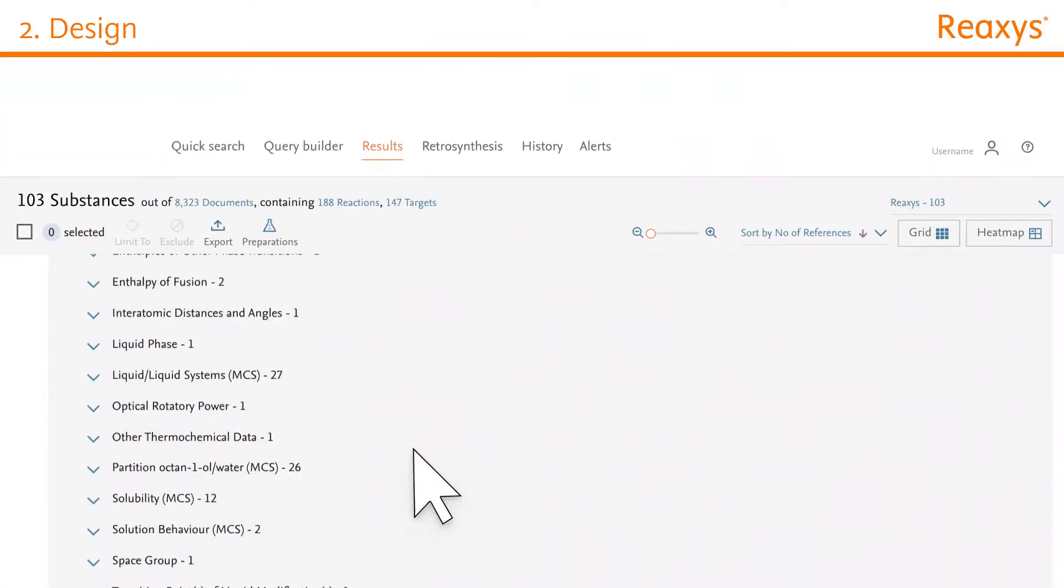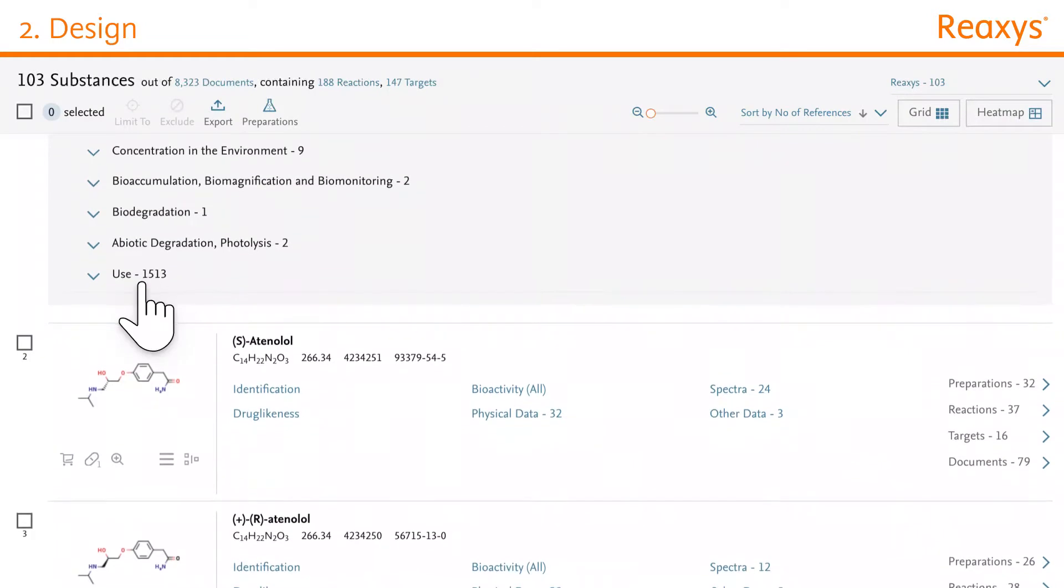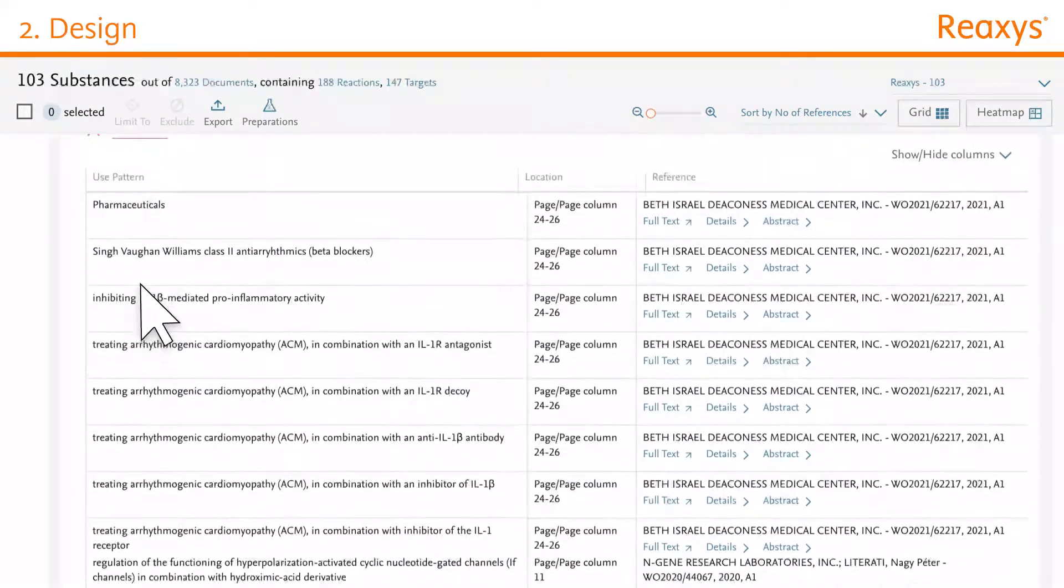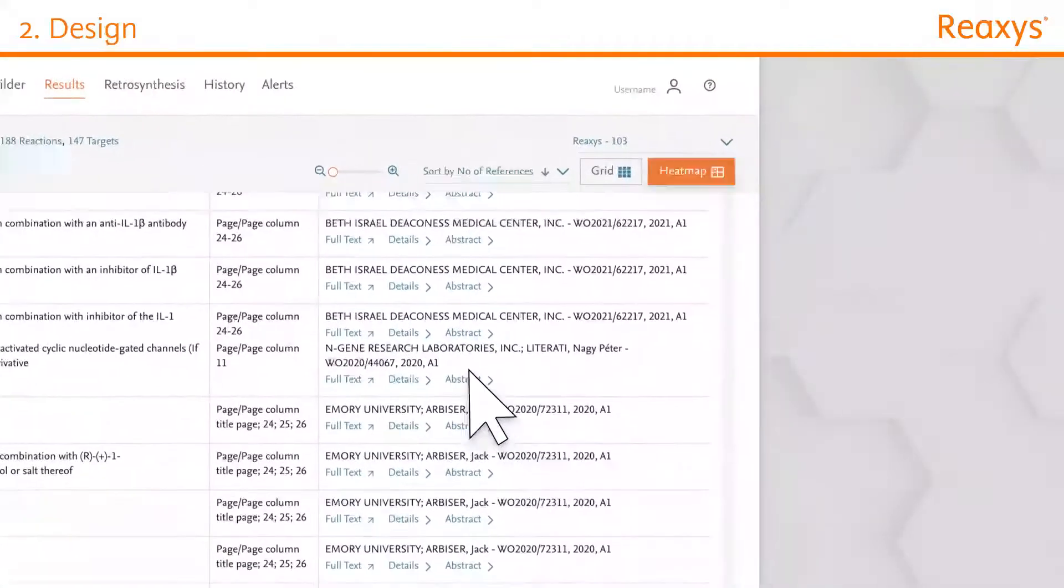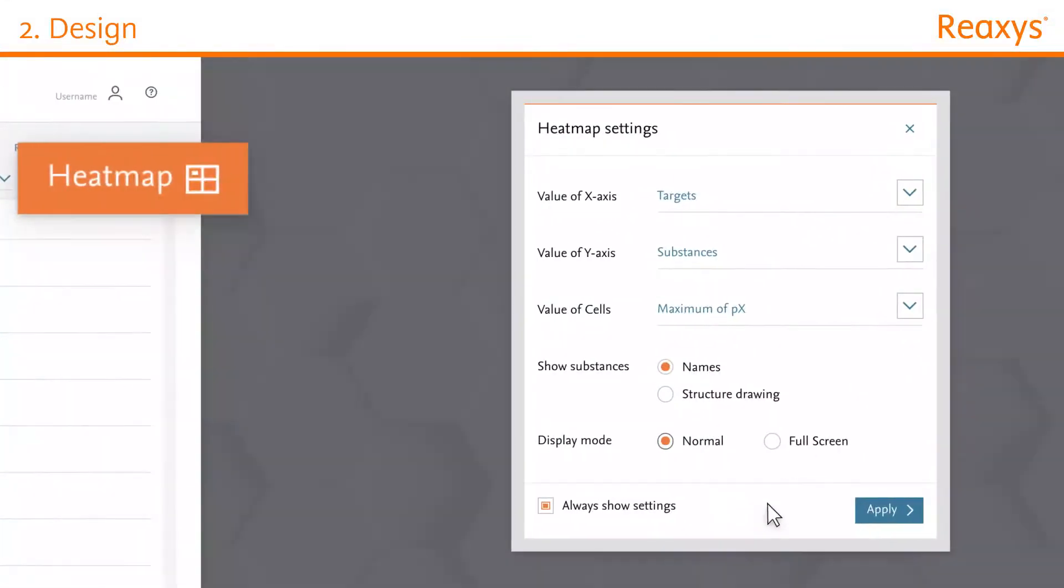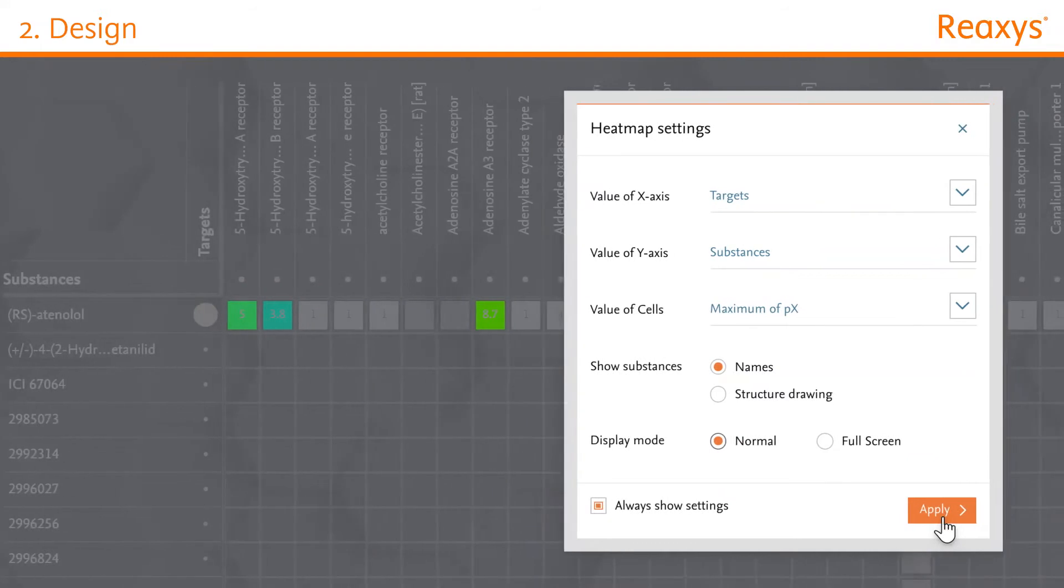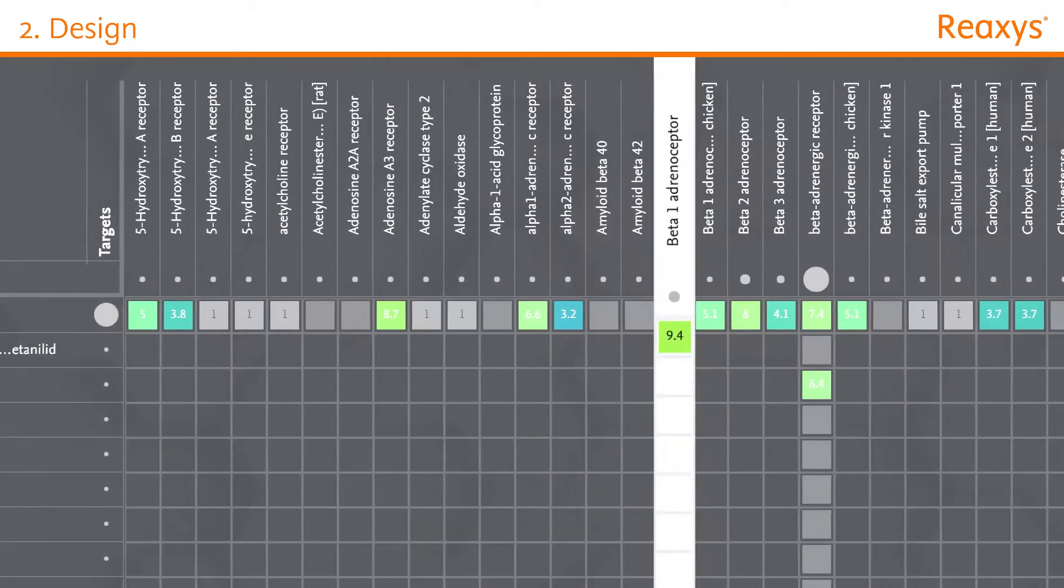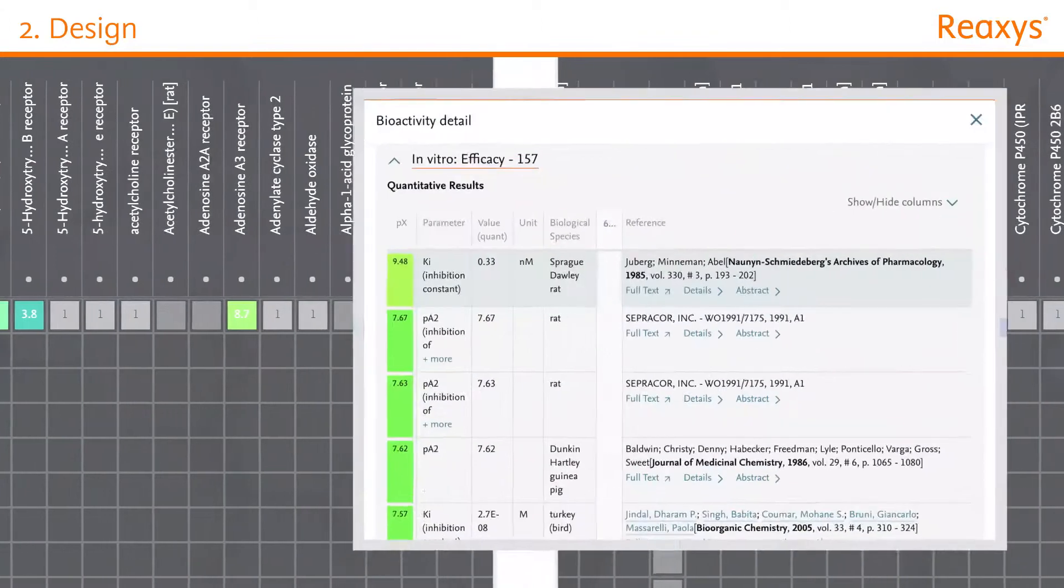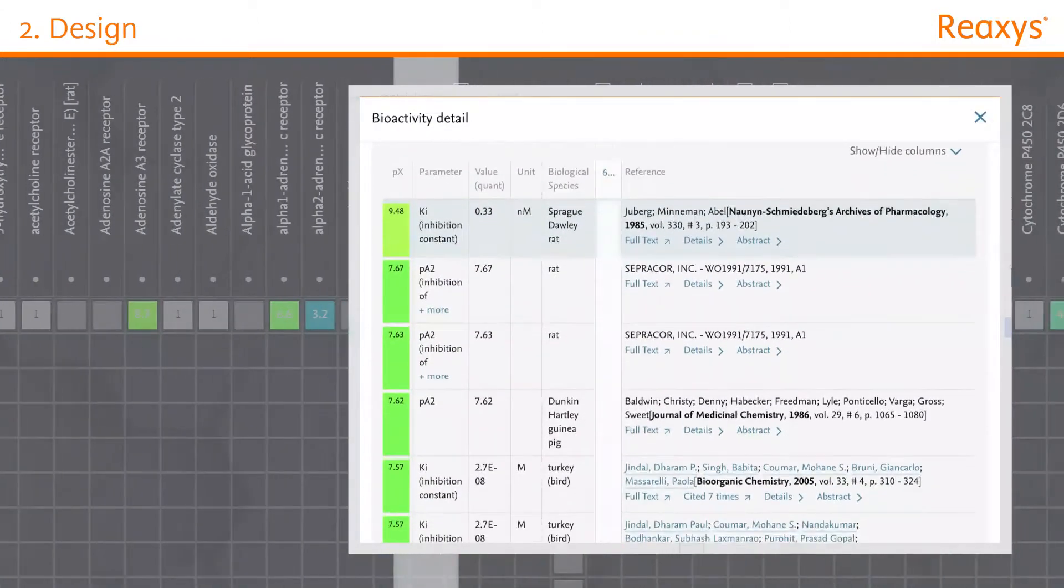Design compounds with new properties, or find new applications for your compound with our reported use information. Use Reaxis bioactivity data to establish structure-activity relationships. Optimize the selectivity and potency of your scaffold or discover any off-target effects.